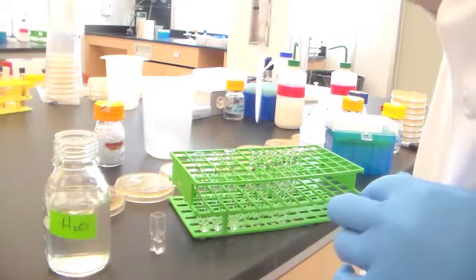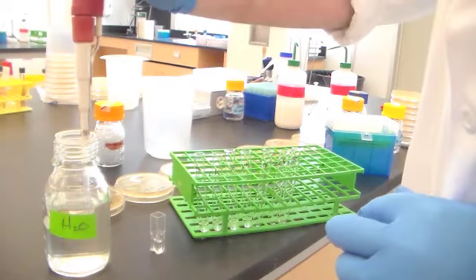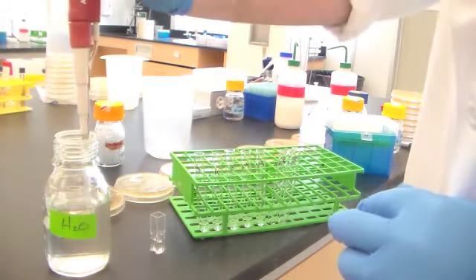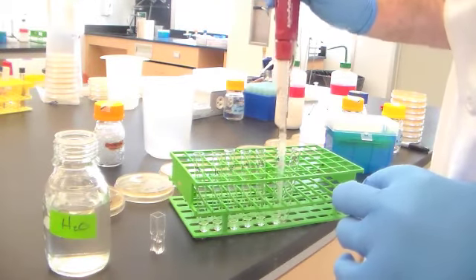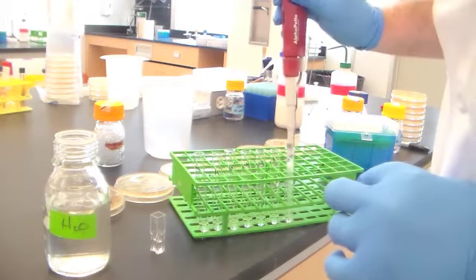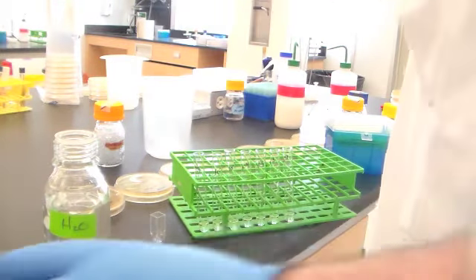So that's 10 to the minus 3, 4. I realize this is a bit like watching paint dry. I lost a drop there. Probably in other lab classes you've learned the principle of serial dilution, but it never hurts to review.